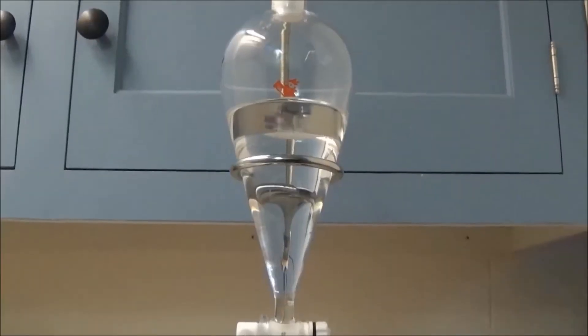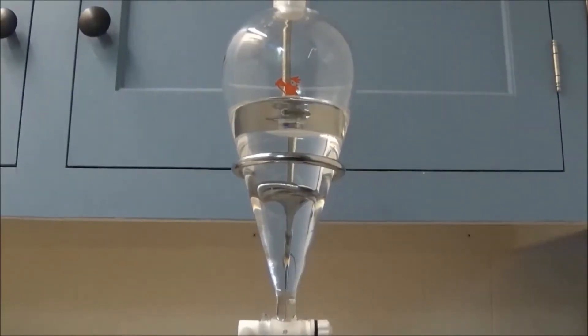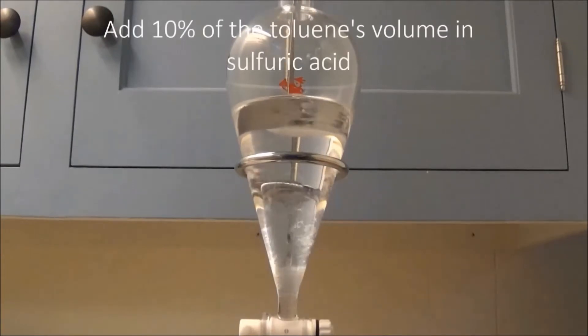I first measured out 250 milliliters of the toluene. To this, I added 25 milliliters of concentrated sulfuric acid.